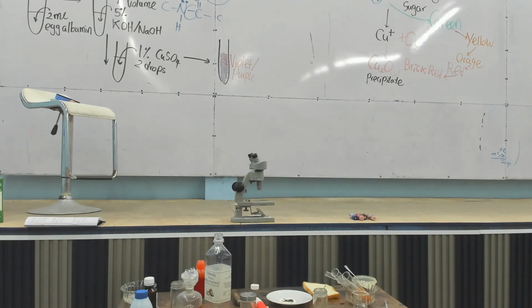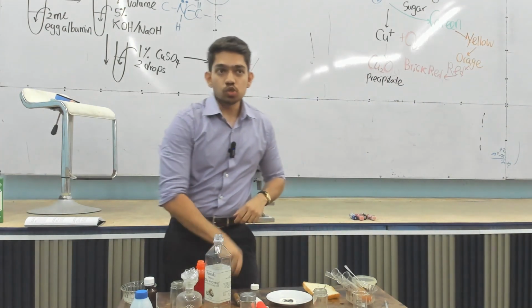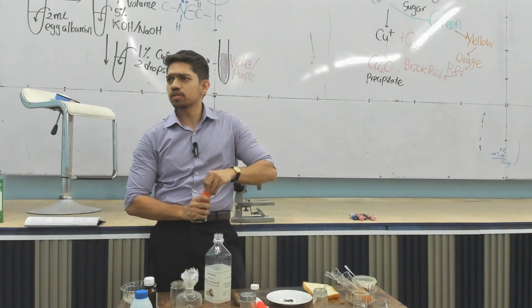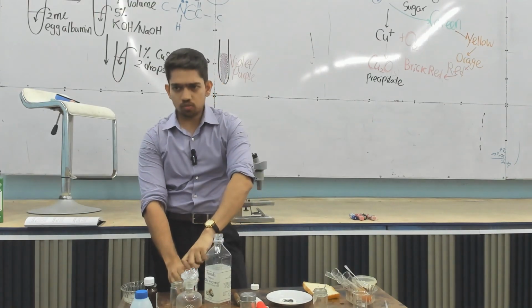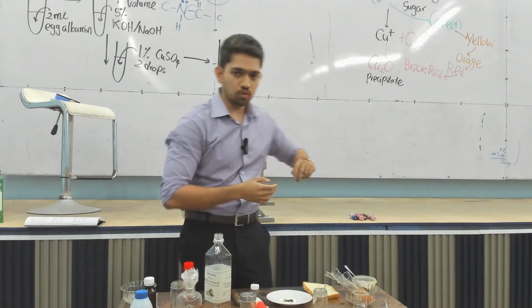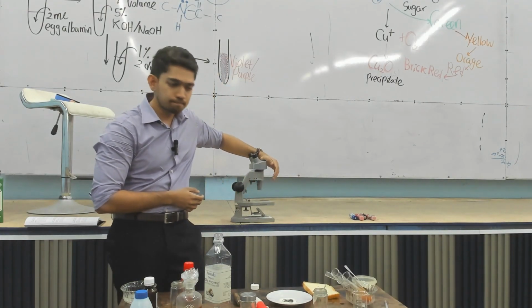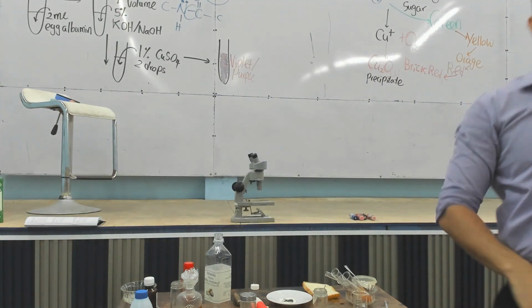Yeah, sure. Okay. So that is the Sudan 3 for lipids. Any questions? No, right? So let's quickly take a note of those two experiments, and we can go to a bit of microscope. Any questions?